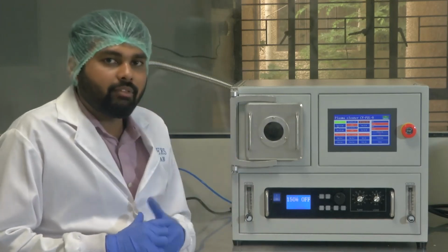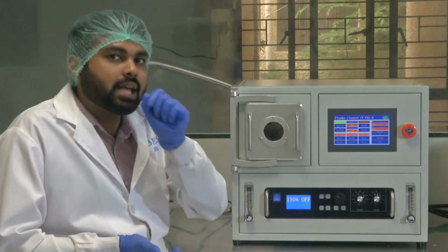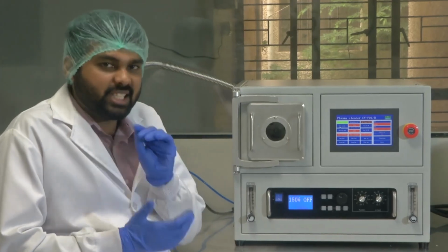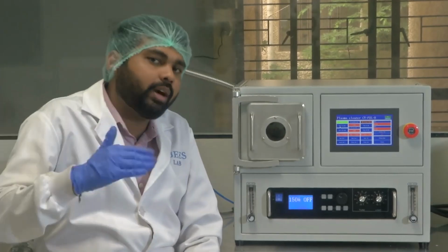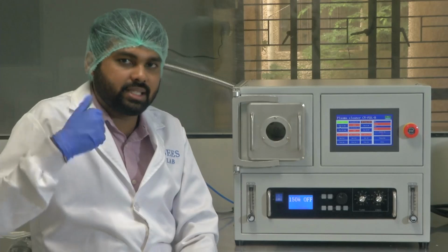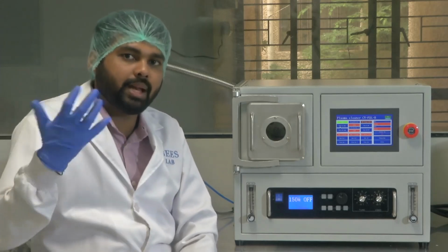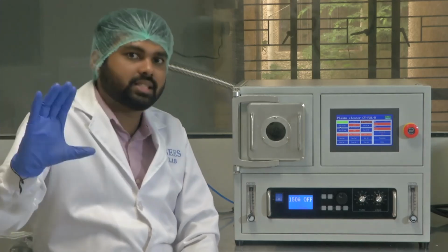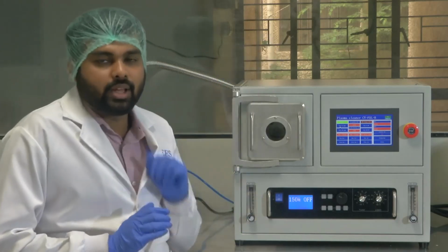So the vacuum pump has to exert more energy to extract the last remaining molecules that are creating that defined pressure. That is why the pressure drops from a very high value to a reasonable low value quite fast. Then after that, going below each Pascal is difficult because it becomes increasingly difficult to extract molecules from that milieu, as they are very few in number. You have to put work on the system to take out that molecule. They have to search for that molecule and take it out. That's why it takes time.